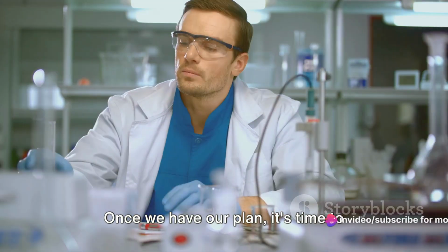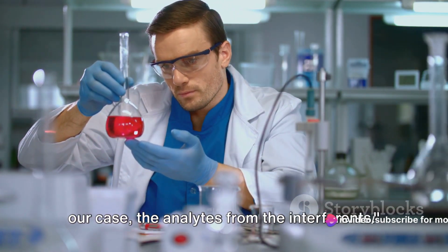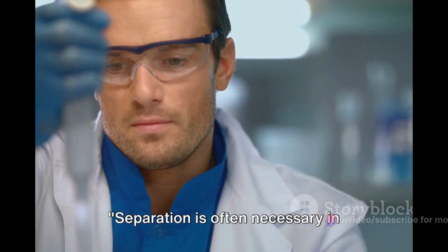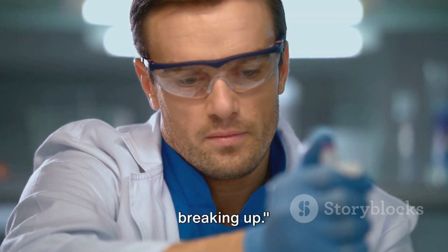Once we have our plan, it's time to separate the wheat from the chaff, or in our case, the analytes from the interferents. Separation is often necessary in chemistry, and we're not talking about breaking up.